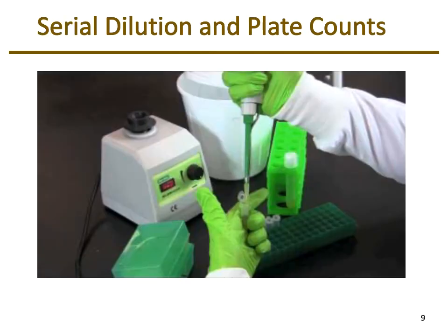So if you look at the PowerPoint slides, there is a video on serial dilutions and plate counts. It's actually from Bioreb, and it goes through the process of doing a serial dilution and then how you would do the spread plate method. So please do watch that, especially if it's been a while since you've done that, because you should be familiar with that procedure as it's used for standard plate count and some of the other counting methods.